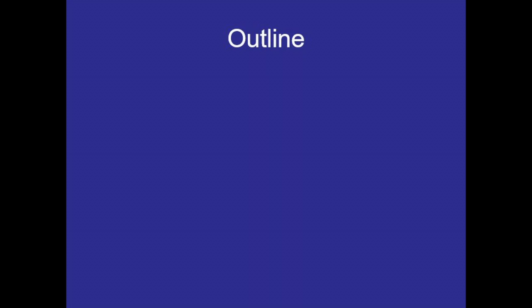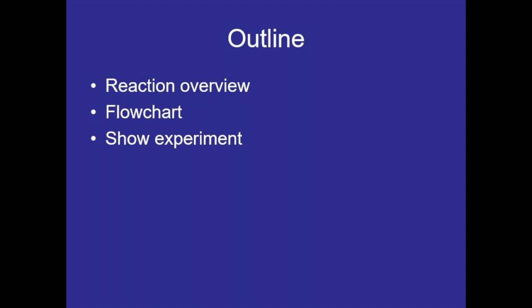Here's a quick outline of what I'll be going over in this video. I'll look at the reaction itself for a little bit, and then to show the procedure, I'll be using a flow chart, which is a nice and simple way of showing the steps to the procedure and how to separate two compounds. And then I'll show the actual experiment in lab, and finally we'll take a look at the NMR because there's some techniques and strategies that will be helpful for this lab and future labs as well.